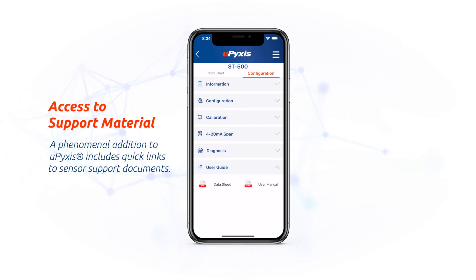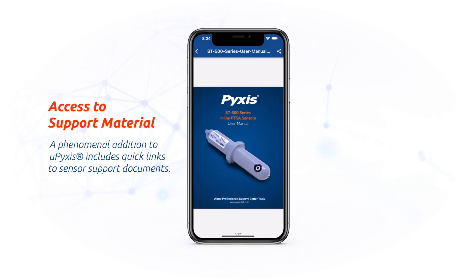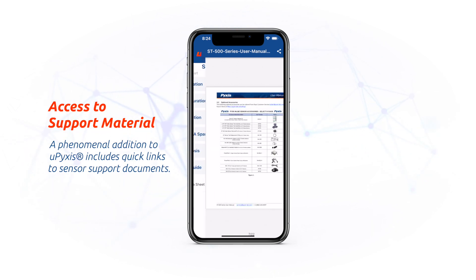And perhaps the most phenomenal addition to uPixis 2.0 are quick links to sensor support documentation. You can access the user manual or even data sheets to pick up on specifications and how to operate your sensor.